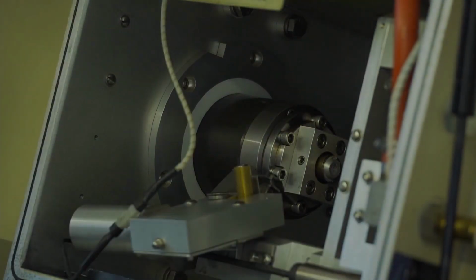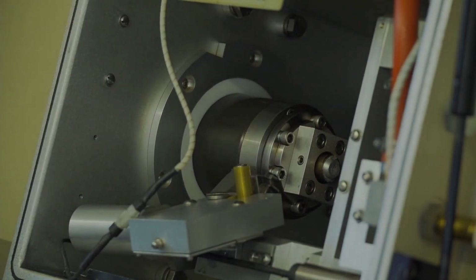So it's like the sample is stuck. So I need to find a way to remove it. This you should expect.